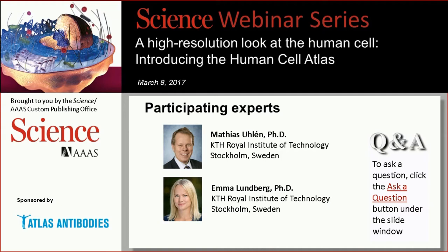Okay, the next question, I think maybe we'll stay with you, Dr. Lundberg, for this one. Why is RNA data important for determining the subcellular localization of proteins? Yes, so when we started the project, we didn't have RNA sequencing data. So it's not important for localizing the protein per se, but any cell line expresses about 10,000 to 14,000 proteins. So if we know that, it helps us to pick the right cell lines to localize the protein in. But that's more or less what it's relevant for.